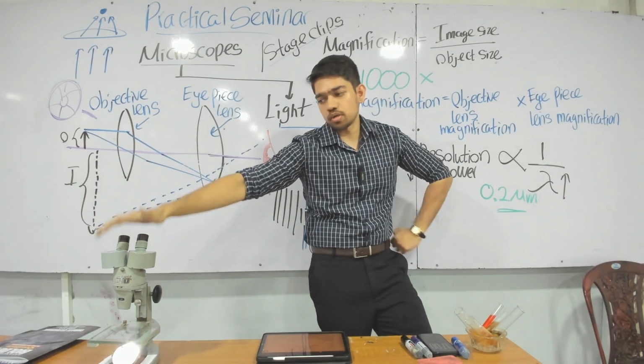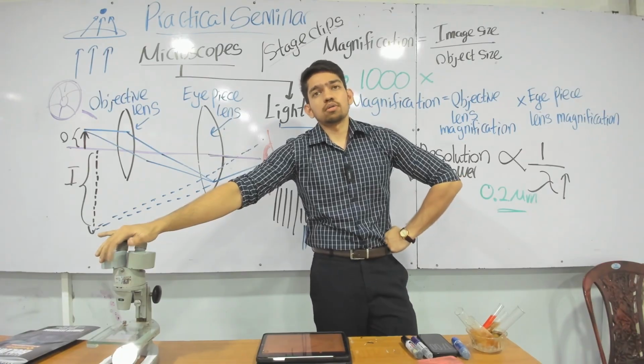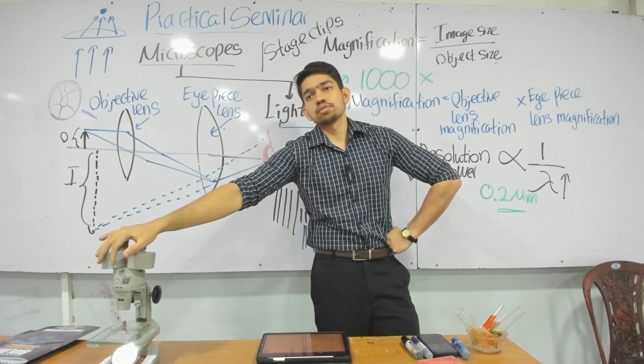Then we discussed the parts of the microscope. Next week we are going to draw a microscope when we are going to do questions.